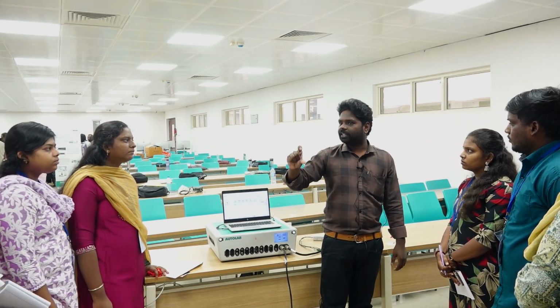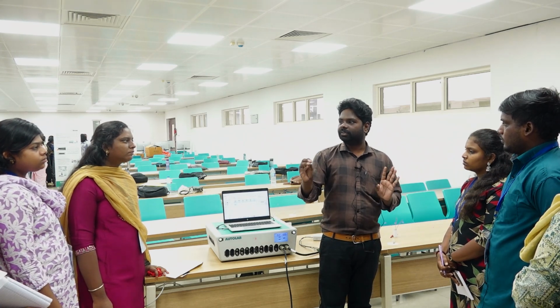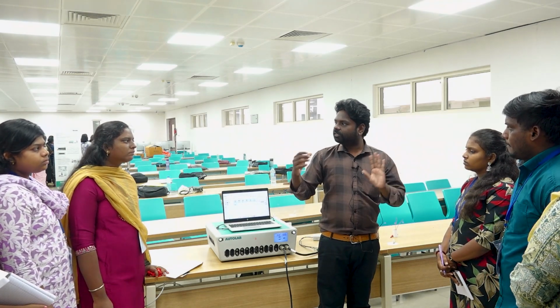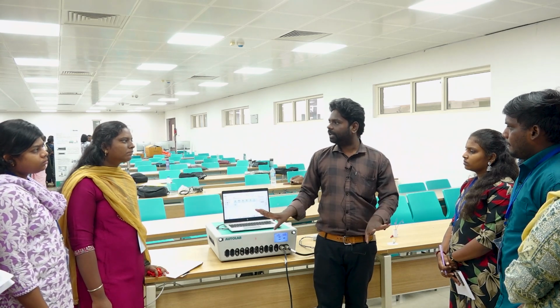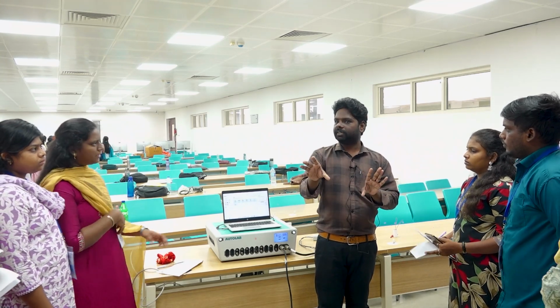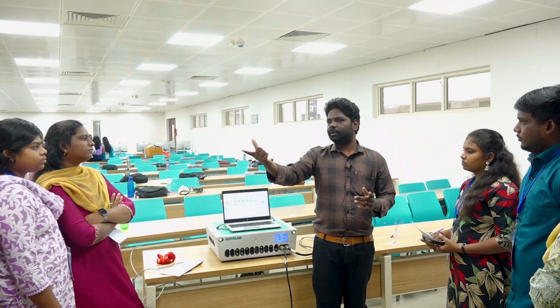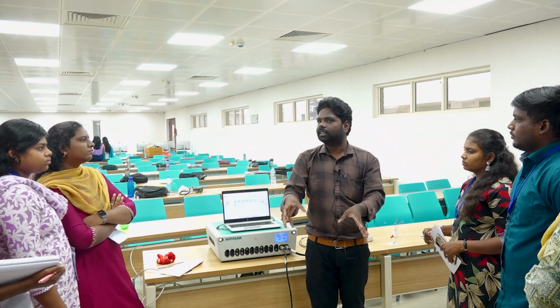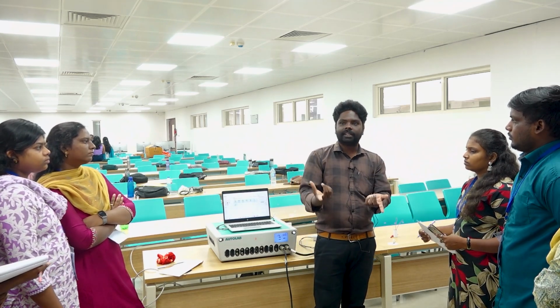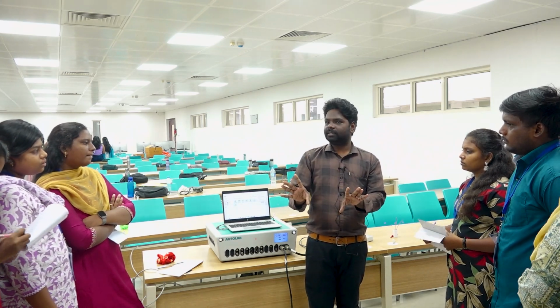Hope it is clear, right? Are you clear or do you have some doubts? If you have any doubts, just tell me, stop me right there, we will discuss and then we will move on. I hope you understand the double layer capacitance. That means your material may not be a capacitor, but once it gets in contact with the solution, it may act as a capacitor. That is not an actual capacitor, that is a double layer capacitor.